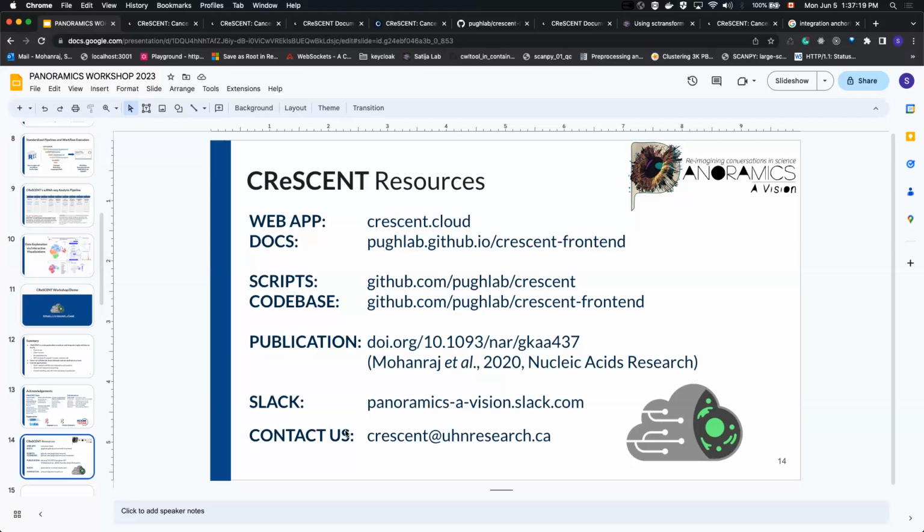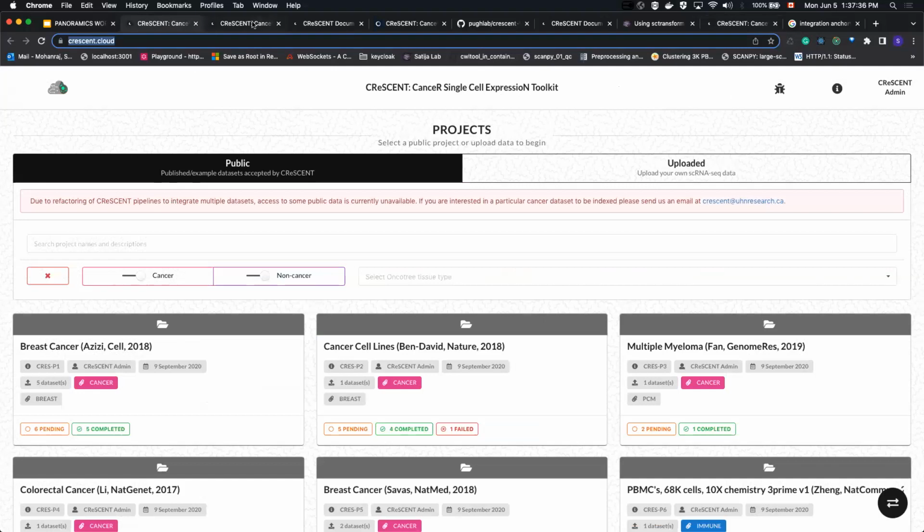I had two general questions. One is, can you at the end get the publication-ready version of the workflow? So that if you use the tool, then you can go to your publication and say, this is how I did it.